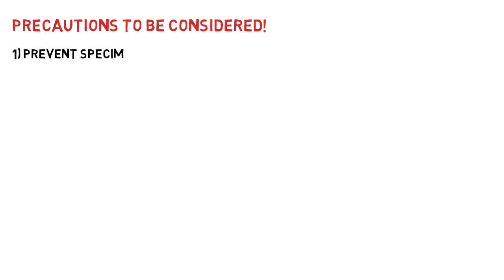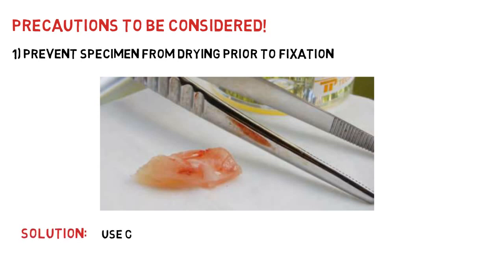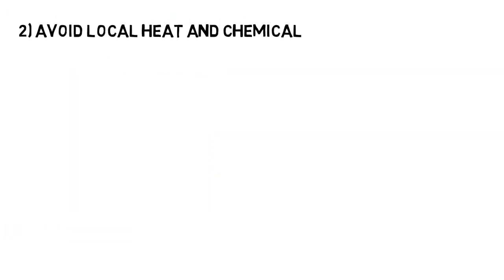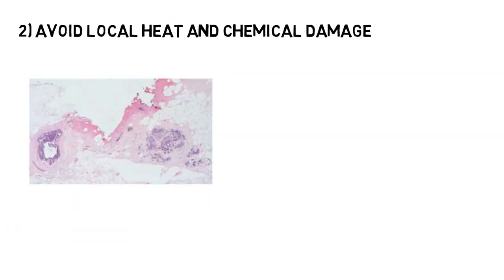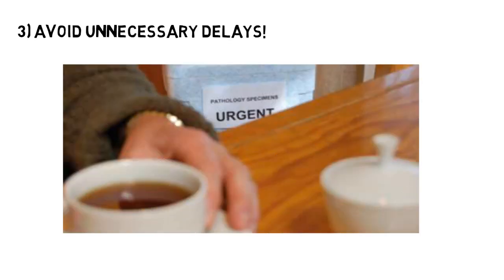Precautions to be considered at reception: Number one, prevent specimen drying prior to fixation — this can be avoided by placing the specimen on a gauze piece moistened with saline. Number two, avoid local heat and chemical damage to specimens prior to fixation. Number three, avoid unnecessary delays and transport it to the histopathology laboratory as soon as possible. Number four, handle the specimens gently.